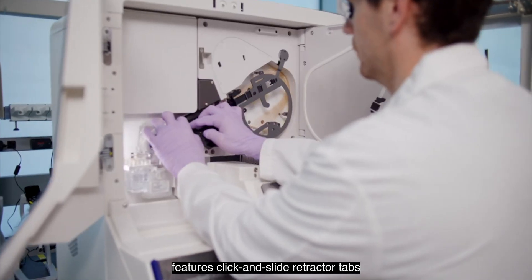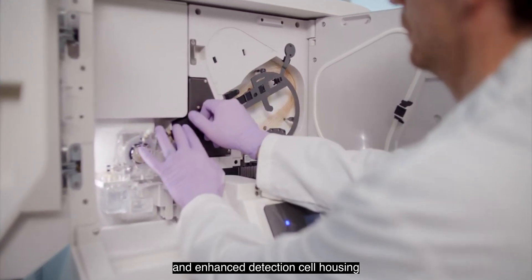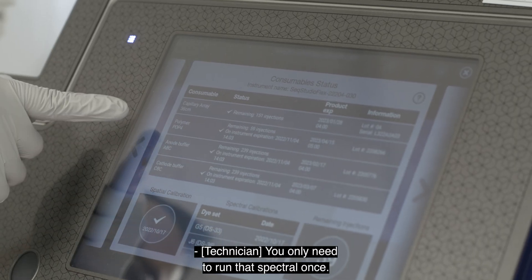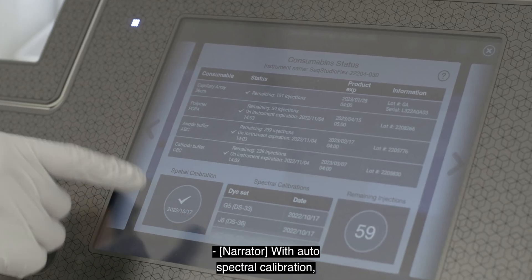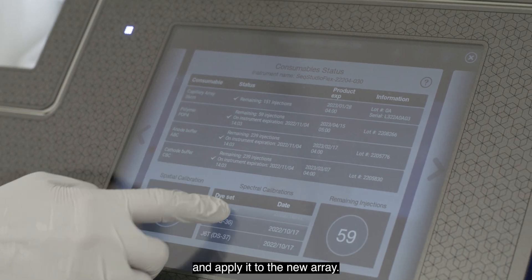The redesigned array features click-and-slide retractor tabs and enhanced detection cell housing that simplifies insertion, positioning, and improves capillary protection for easier handling. You only need to run that spectral once — throughout the entire life of the instrument. With auto-spectral calibration, the SeqStudio Flex system will remember the spectral you've run and apply it to the new array.